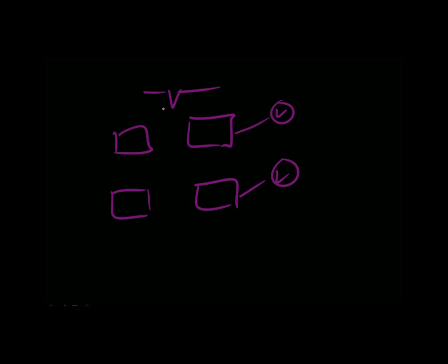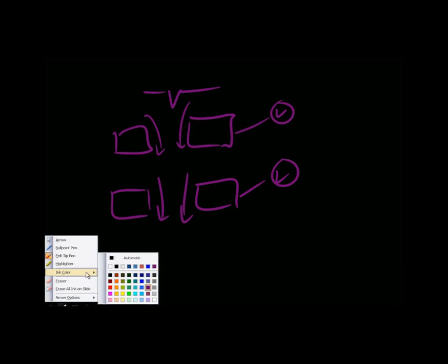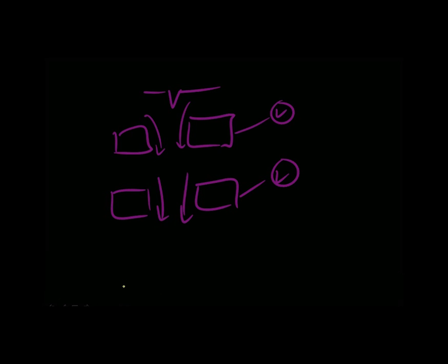Okay, so here we extract the electrons, and here we can further accelerate the electrons. Extract, accelerate. Different voltages here.